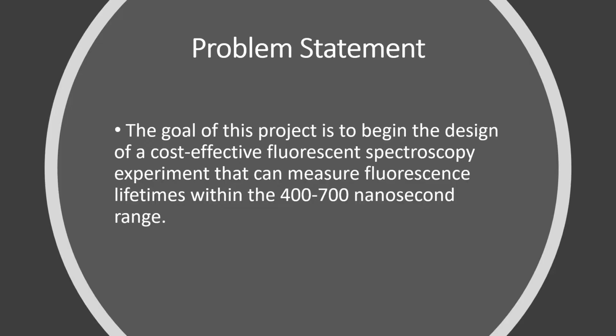So, this is where we stepped in to help alleviate these concerns. So, the goal of our project was to begin the design of a cost-effective fluorescent spectroscopy experiment that could measure fluorescent lifetimes within the 400 to 700 nanosecond range.